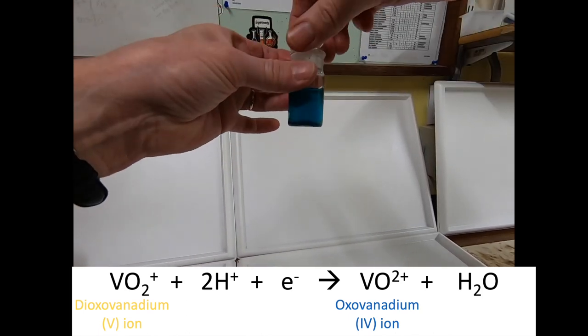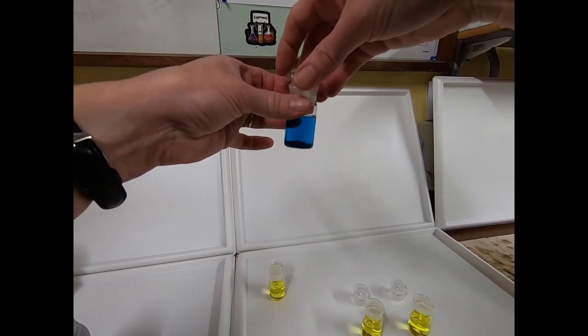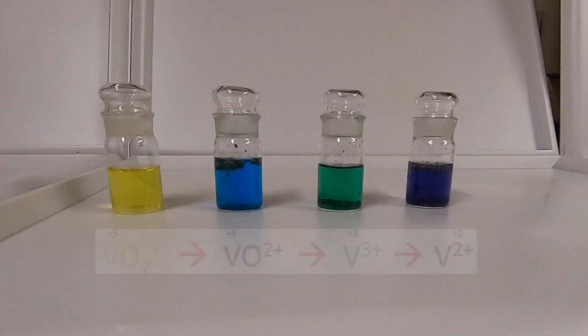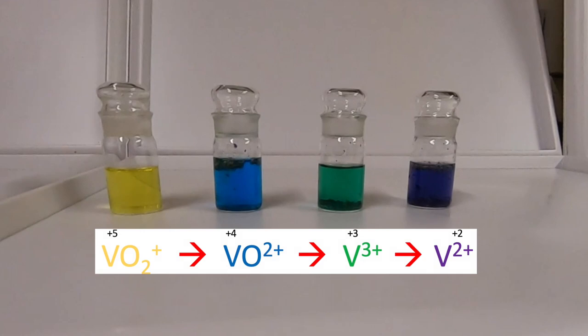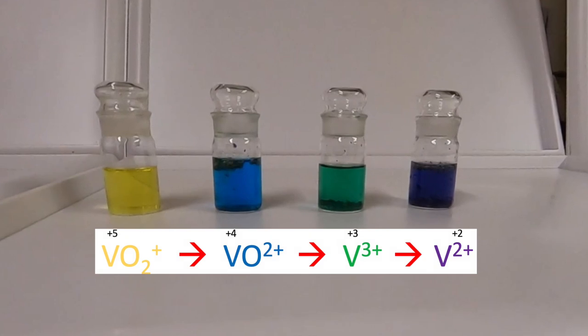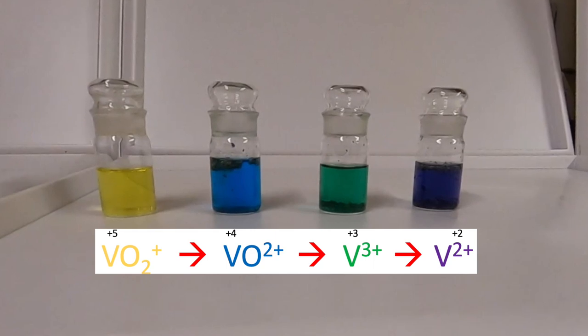You can see here the four different colors of solutions in the variable oxidation states of vanadium: the yellow solution in the oxidation state of +5, the blue solution in +4, green solution in +3, and the violet solution in +2.